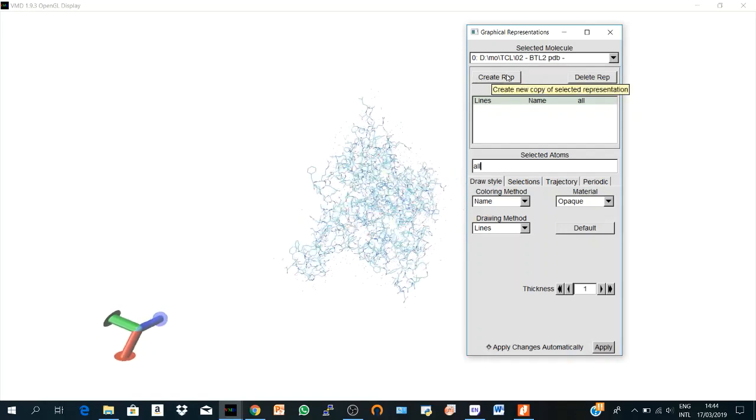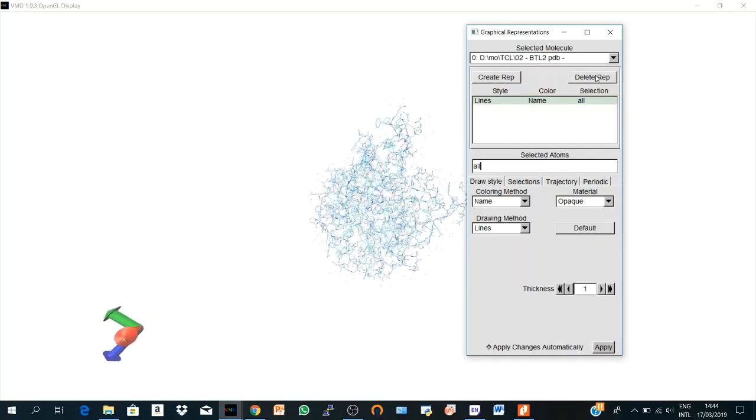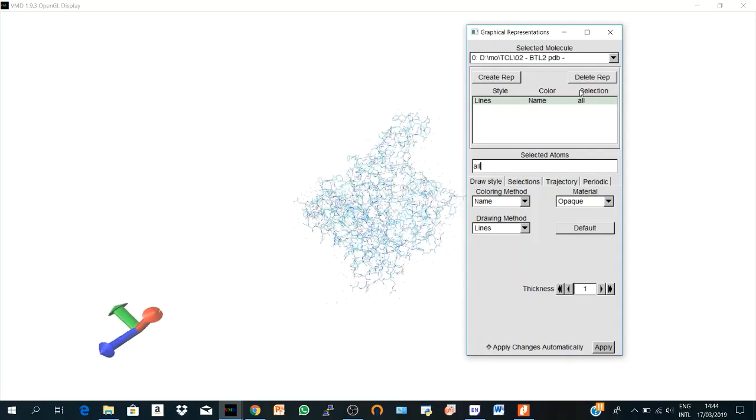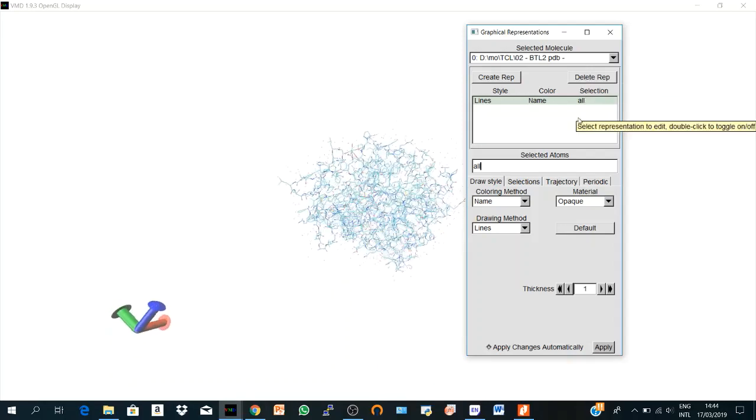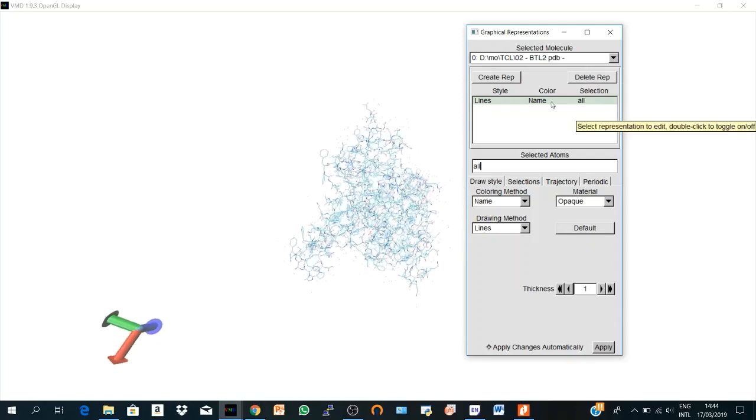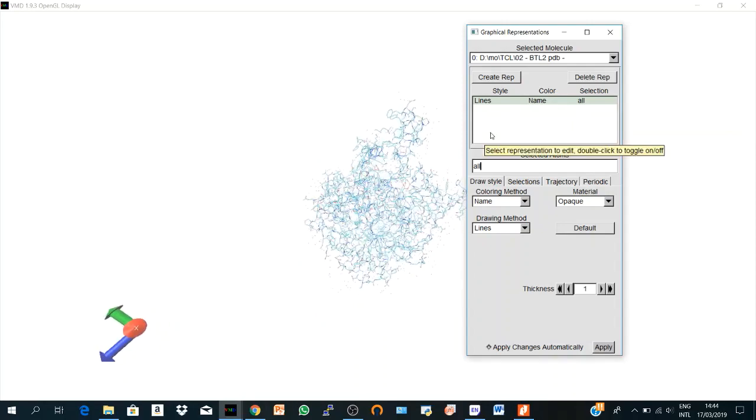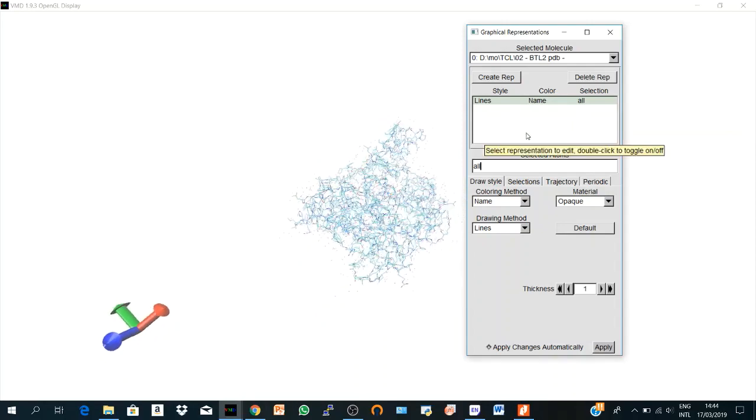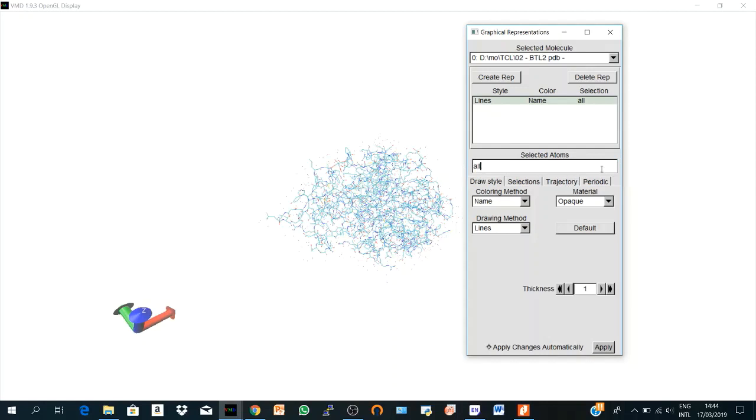And here you create representation and you delete your representations. The representations that you create will be seen here in this representation bar. So by default, we have here our representation. It's called 'all' and this section is where we define the selected atom text entry. So by default, all the atoms in a structure are represented here.